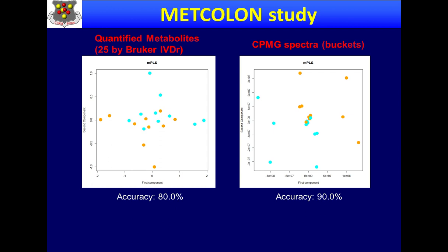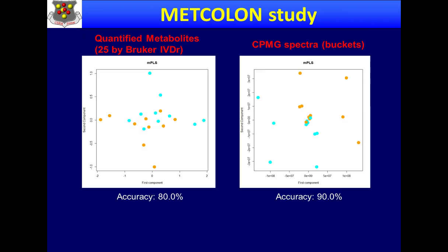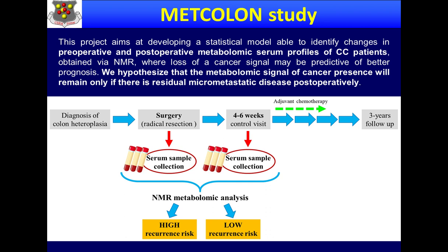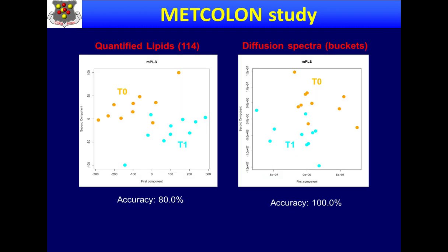So this speaks somehow in favor of continuing the effort of identifying and quantifying more and more metabolites to get asymptotically closer to the amount of information that is contained in fingerprinting, with all the extra benefits, of course. And here you can tell which are the significant ones, and this is very significant, a log 2 of -2 or so: 3-hydroxybutyric acid and acetone, and this was significant to identify high risk and low risk. But it's not so relevant what we gather, and this is still a study in progress.